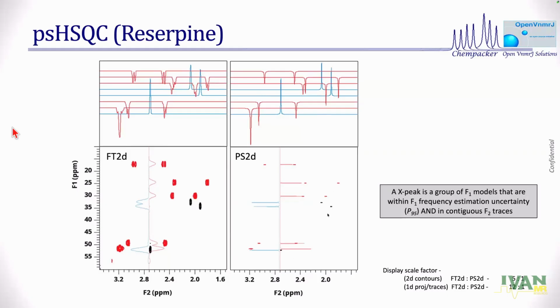processed with CRAFTps. Watch all these doublets, which are on the geminal coupling, which we understand all of that. If not, you go to Manchester's fantastic website. There's a good explanation for all of this pure shift methodology. My source for understanding many of these.